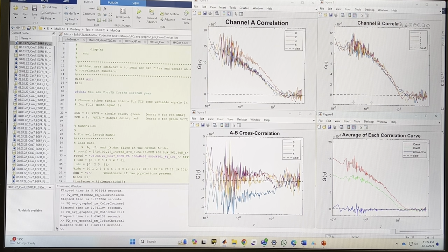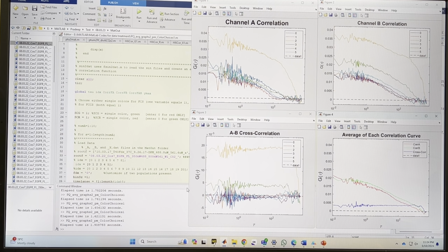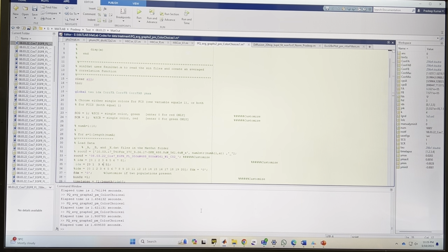Once you know that this looks good, you go here, Control G, and bring all 6 units again, and then change the parameter here, like 1 to 2, cell number 2, and again press the F5 key. Oh, so here this 2 is really looking bad. One is number 2, another one is number 4. So I'll remove number 2 and number 4, and then F5. Now I see it looks smooth, all 4 remaining. So we can go with that, and Control G will bring all 6 points back.